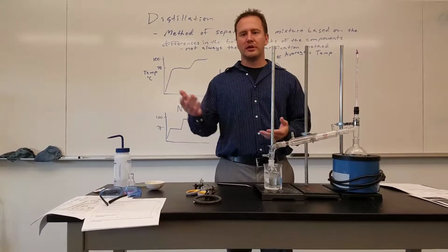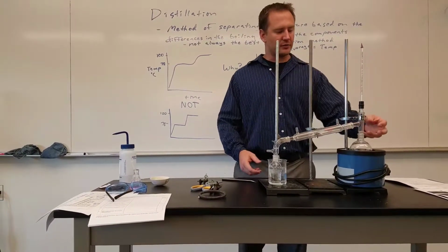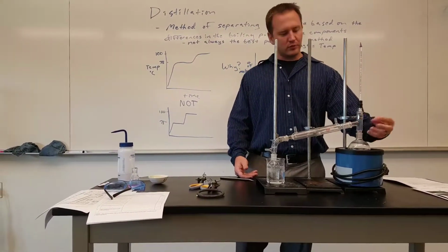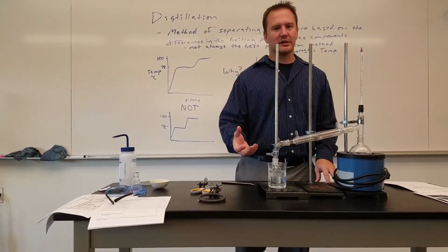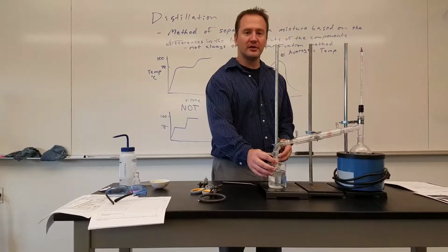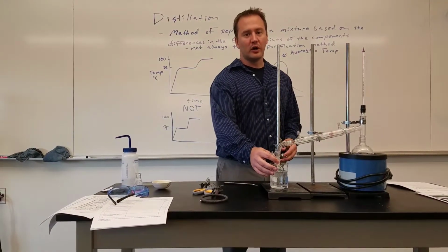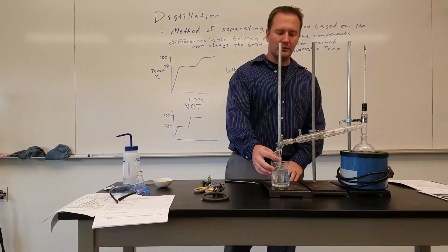Obviously, there's water vapor in the air at room temperature, so if you're heating it up to almost 80 degrees, there's going to be much more water vapor present. So some of that water vapor will be part of the mixture in here that then condenses and gets collected. However, it will be a much higher percentage of the first liquid in here than there is water. And if you repeat this distillation process multiple times, you get a more and more pure sample.